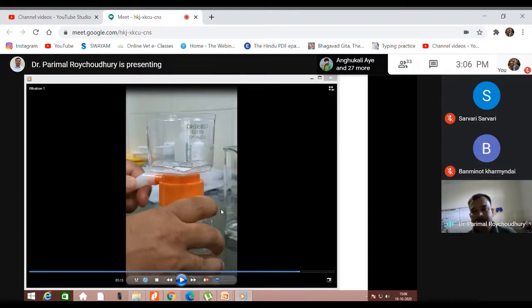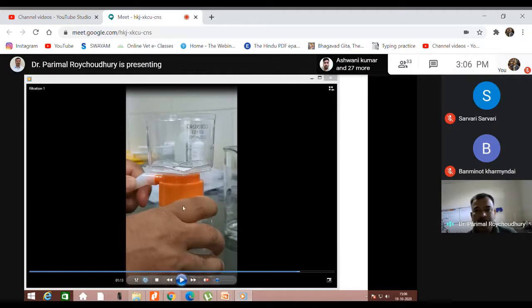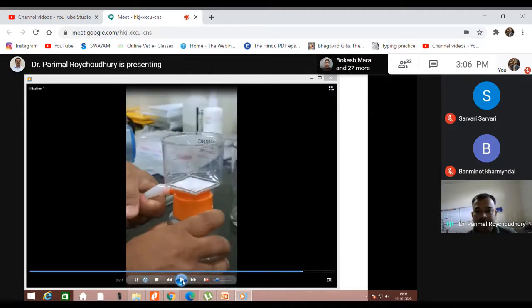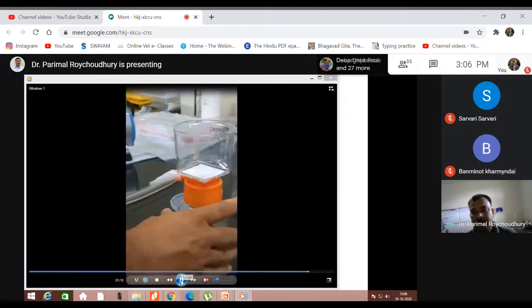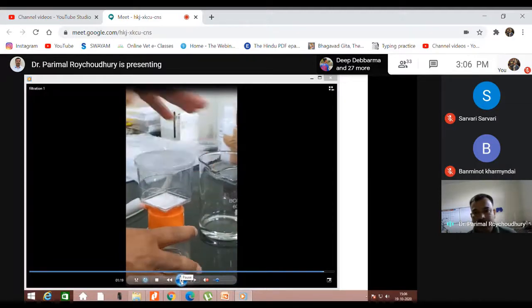So this type of membrane filter is used for filtration purposes. Once the filtration is complete, we have to open it up. This part is not shown here. We have to open up this whole device near a flame in a laminar airflow, and we can put the cap on and sterilize this item. This way we sterilize the serum that we use for biological work.